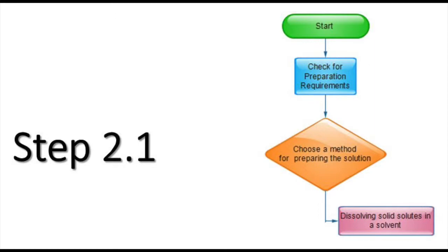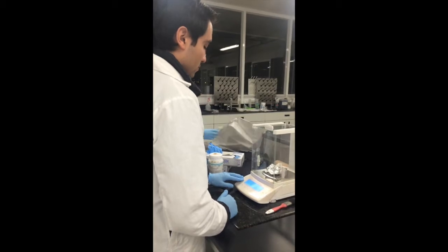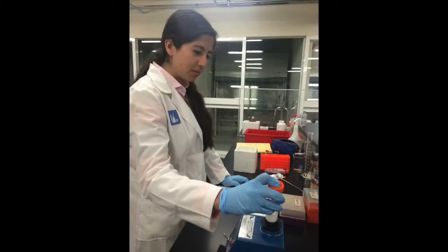To make a solution in this way, you must know how much of the solid to use and how much of the solvent to mix with it. Use the following formula to calculate the weight of the solid needed.